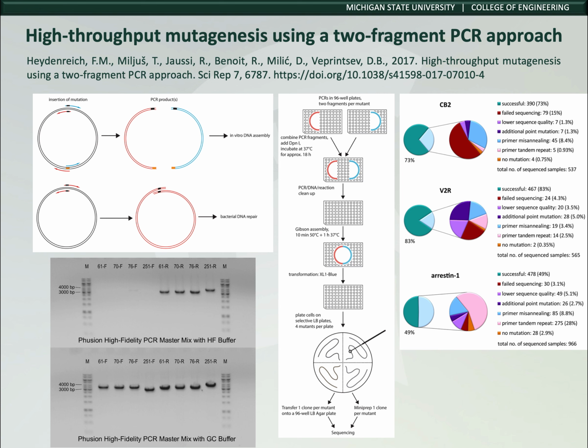Hello. In the article shown above, the researchers focused on alanine scanning mutagenesis for analyzing protein functionality at single amino acid resolution and design of stabilized proteins. Standard site-directed mutagenesis is a challenging, expensive, and time-consuming process, considering that you're creating libraries of hundreds of mutants and there are PCR sequence errors like misannealing and tandem primer repeats during mutagenesis cloning.